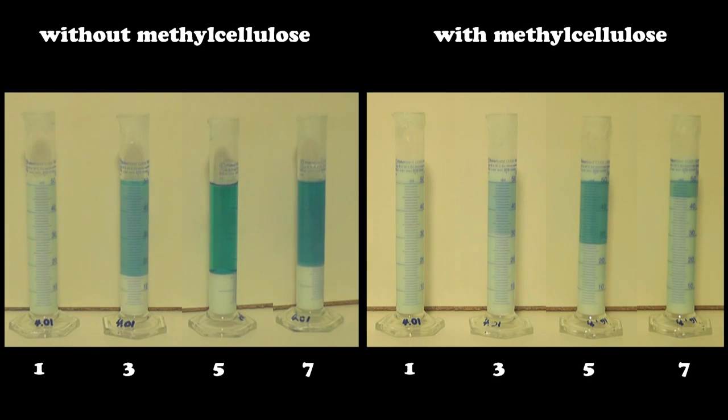The addition of the viscosity enhancer will also not alter the final properties of these suspensions. Once settled, suspensions 1, 3 and 7 will all exhibit caking, whereas suspension 5 will remain easily redispersible. The advantage, then, of employing a viscosity enhancer is that it allows the particles to remain dispersed long enough for the patient to take an accurate dose, whilst using a flocculated suspension which will not exhibit caking.